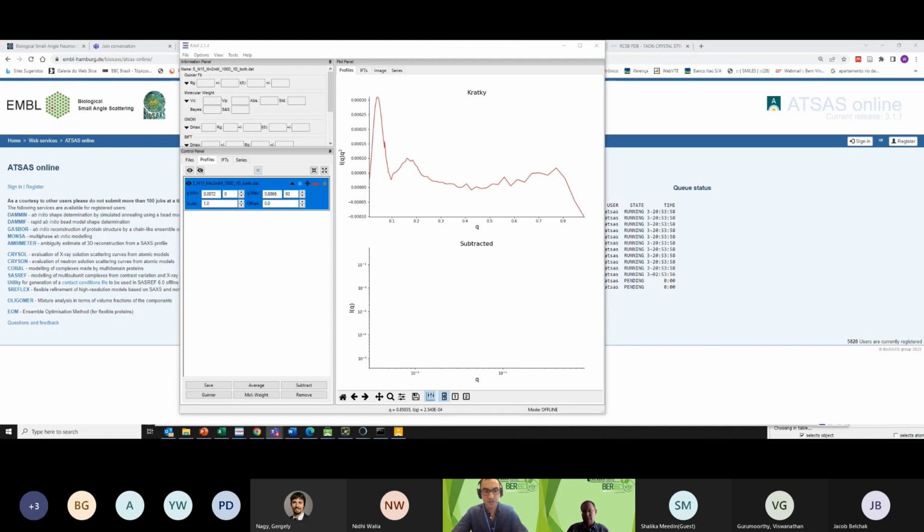There is DENSS that also does electron density reconstruction for the SAXS data. It's a new feature that we can use. I think Nidhi is already using that software. We are more than happy to help you all. Hugh, do you have any words? Yeah, I think, not really.